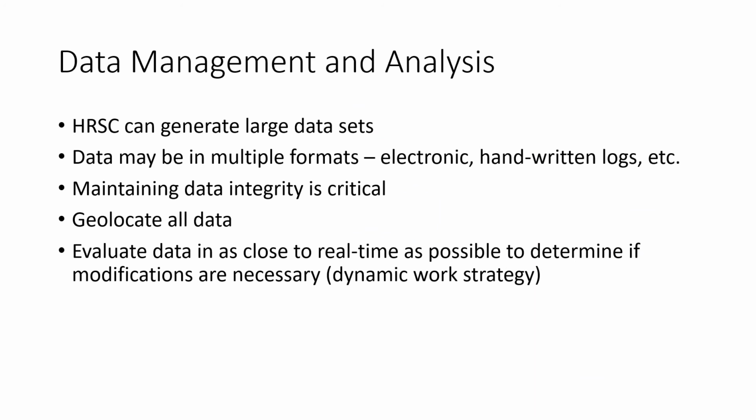Proper data management and analysis is critical to any successful HRSC sampling effort. HRSC often generates very large data sets which require a pre-designed strategy for effective management, analysis, and communications. For field efforts using a dynamic work strategy data collection approach, newly collected data are ideally processed in real time. Following data quality assessment, the data are stored electronically and then evaluated spatially to refine the conceptual site model and to support the dynamic selection of additional sampling locations.